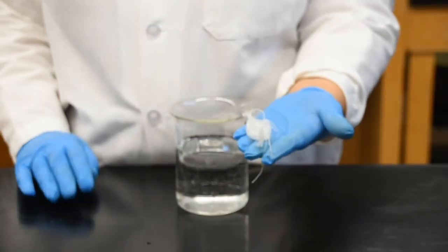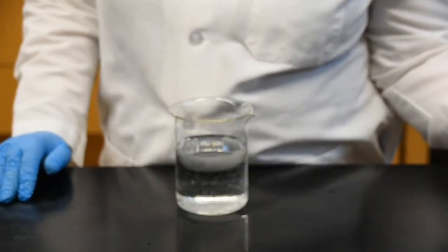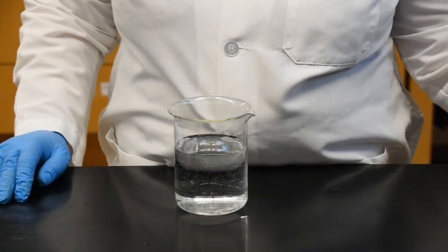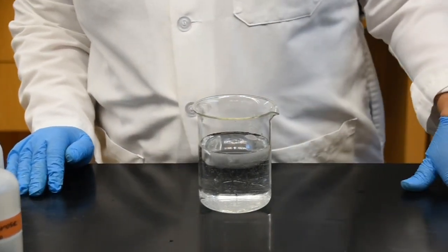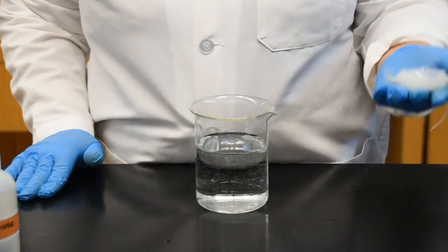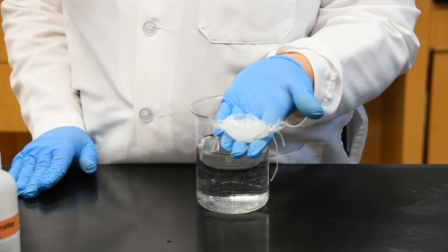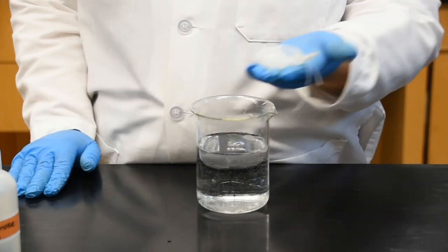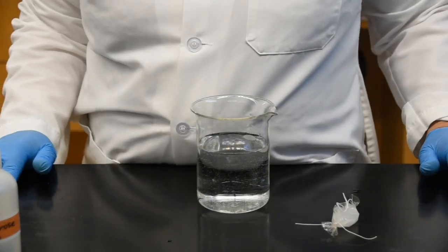So before I do anything, what I want to do is I'm going to weigh this baggie on my balance. And when I measure this, the weight of this baggie is 21.5. So I've already done that. So the weight is recorded as 21.5 grams. The other part that you need to record is the color of this bag. And again, you can see the color inside this baggie is cloudy because of the amount of starch you have in the sample. Now the last part of this table that you have is asking you for the color of the beaker solution.